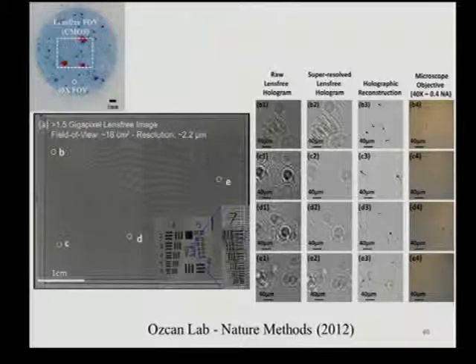You can also do CCDs, and then the scale bar becomes a centimeter, and that's where the advantage of a CCD is. You can look at a 10, 20 centimeters square in a snapshot. Of course, that comes with a resolution loss because generally speaking, CCDs have larger pixel size. So super resolution helps, but still cannot give you deeply sub-micron resolution, as in the case of CMOS technology. But still, from very pixelated images, you can go to sub-pixel holograms, reconstruct. These are sub-micron tails of human sperm that can be reconstructed. In this case, the resolution is about 2 micron, which gives you about 1.5 gigapixels.